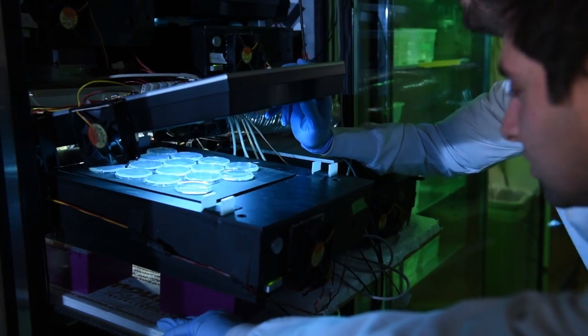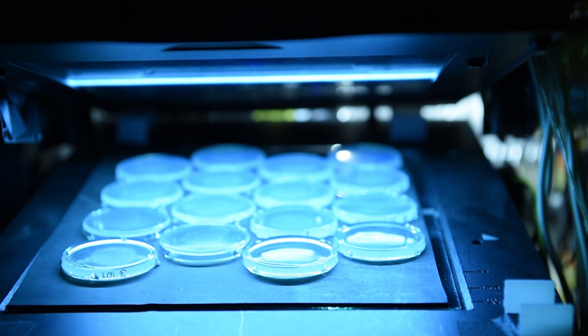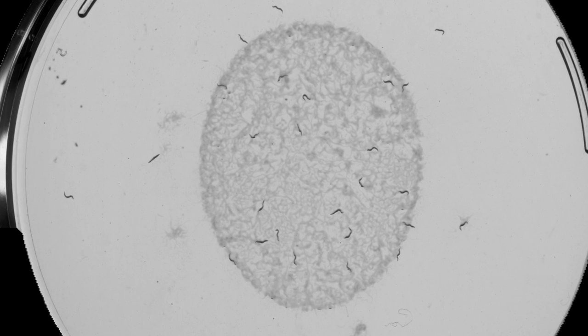You take a single scanner and it fits 16 plates. Each of these 16 plates can hold, say, 50 worms. And then you can buy as many scanners as you want. For certain nightmare weeks, I have run two to three incubator experiments with as many as 15,000 worms.